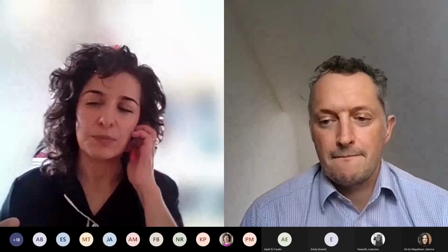So when it comes to labeling, what we've looked at mainly has been gold labeling. And of course, then your particle looks a certain way, right? So if you want to do a detection and analysis, that's fine. You can see in your microscope, you can pick it out and you can do the analysis. Now, if you want to use AI for that, the question is, will you be training it to detect particles that have got these black dots?